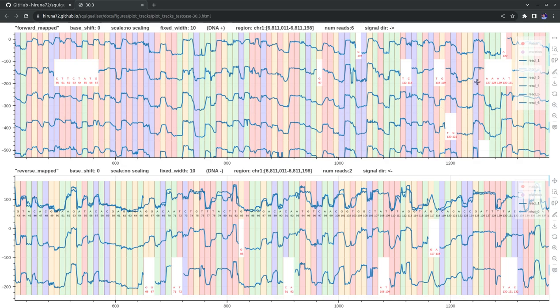Now I want to use the freehand tool to do some annotations. Just click on this icon and I'm going to annotate the deletions that I see on the screen. This is a powerful way to present something on the Squigualiser plots themselves. And let's say I don't want this annotation. I'm going to click on the annotation and press backspace. And like that, that annotation is deleted.